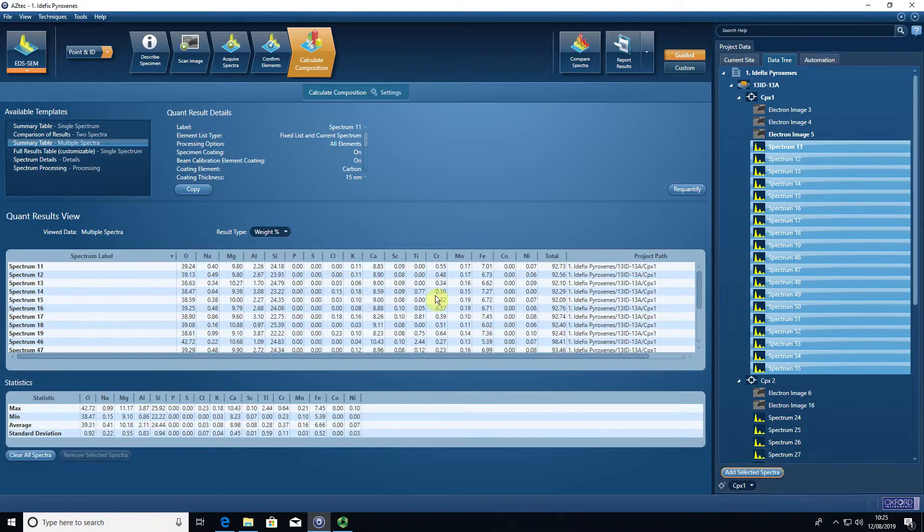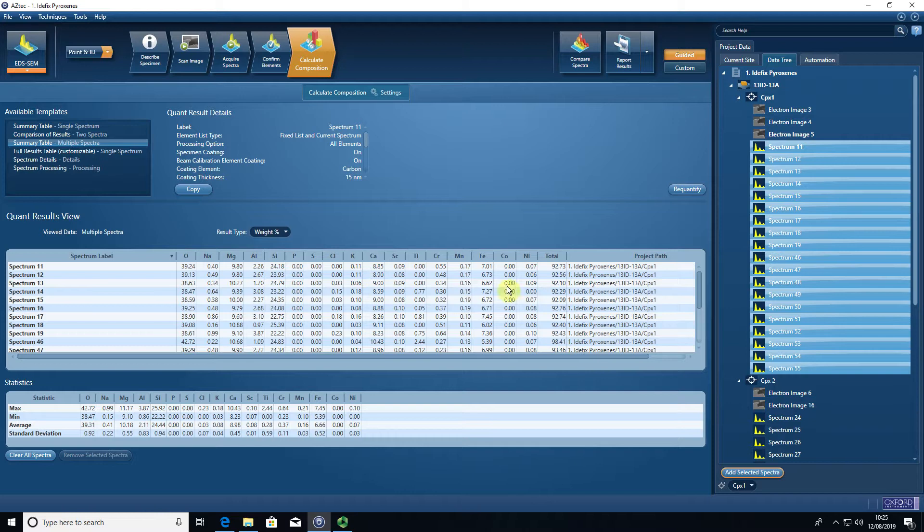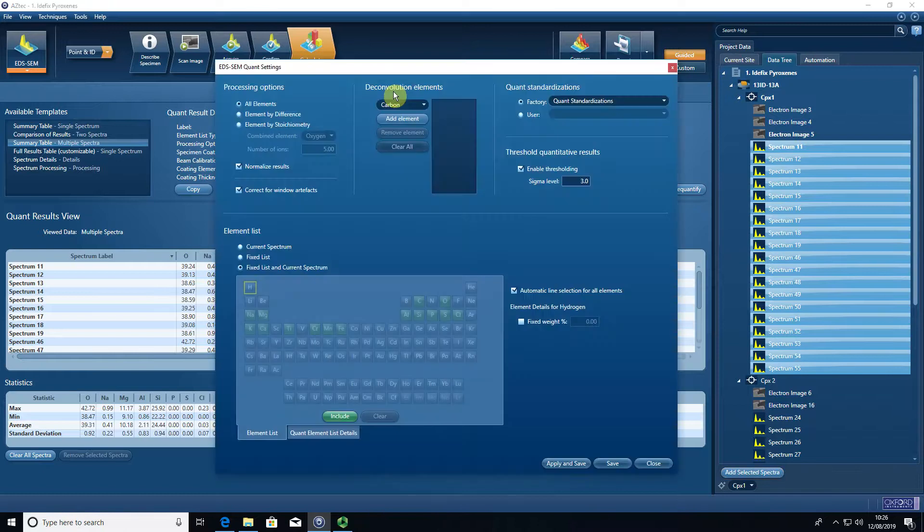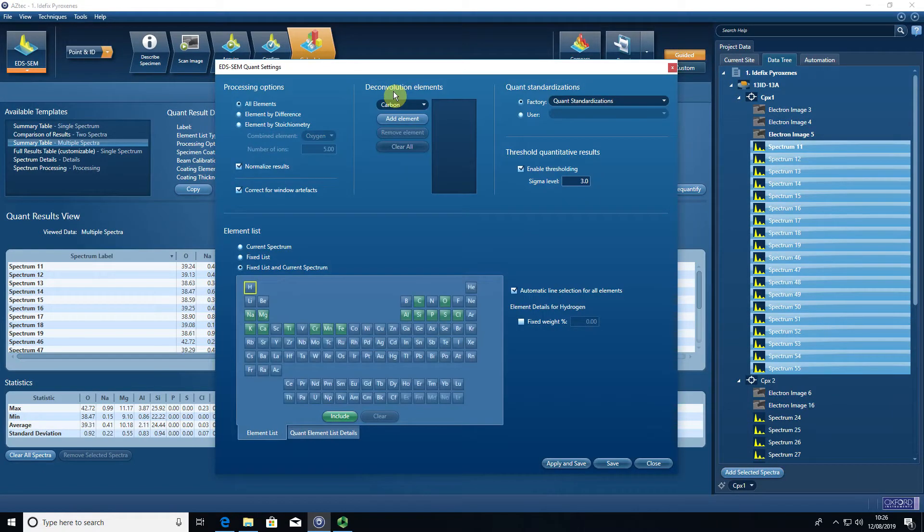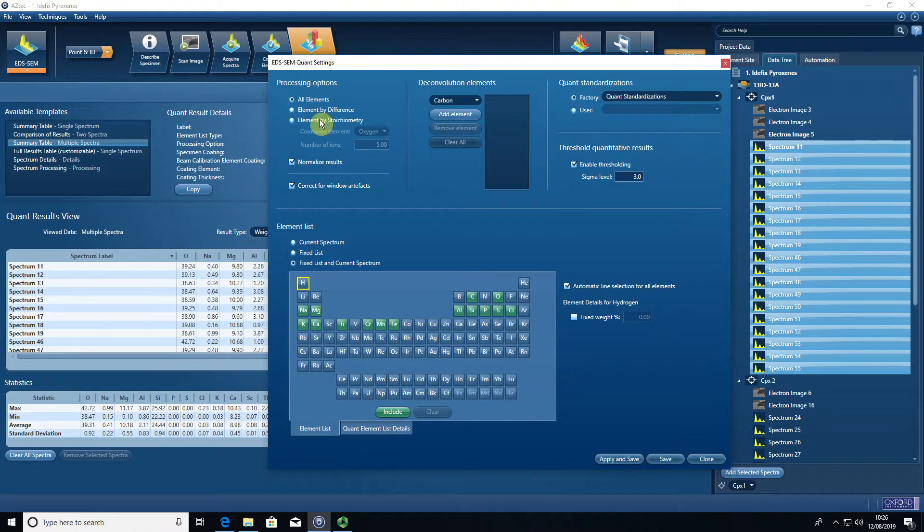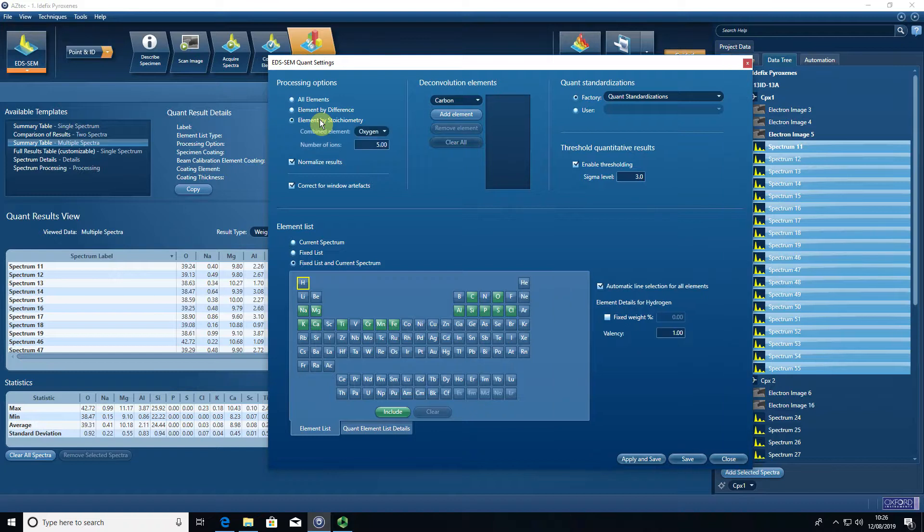I then get a list of all the chemical data for these spectra, and the first thing I need to do is check that my settings are correct. This is clinopyroxene. For most silicates, instead of measuring oxygen, we balance it by stoichiometry. We measure the cations and we balance oxygen by their charge.